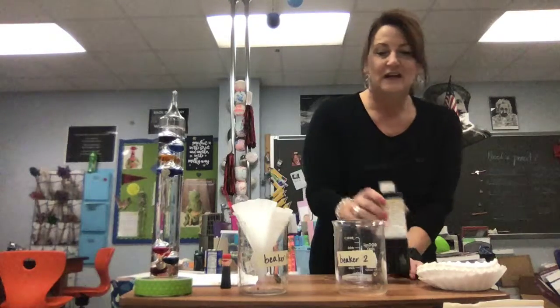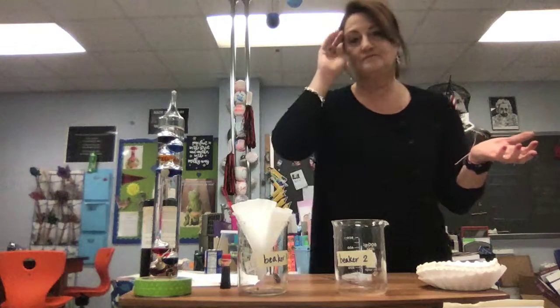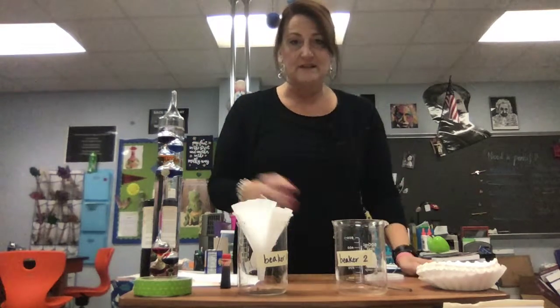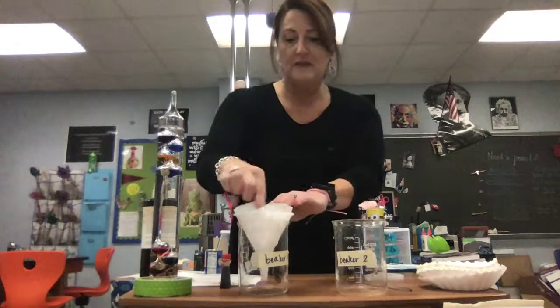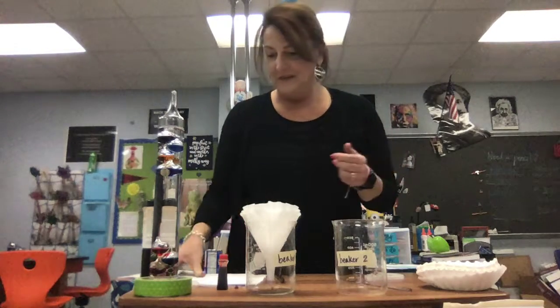Hi, boys and girls. I want to do a quick demo of our lab today. If somebody's absent, you can watch it. And then for Miss Dry's class, because she's out sick today, I'm going to do a quick demo of the lab, and then you can answer the questions like you would if she were here.